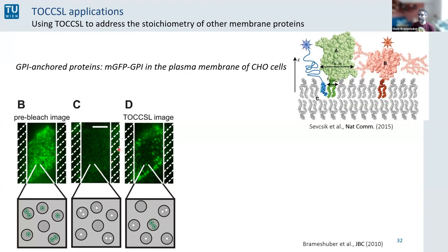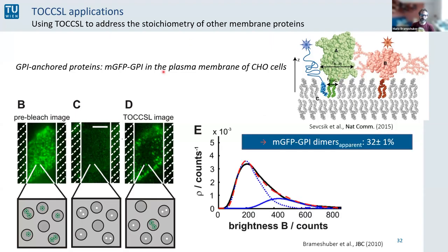What we basically detected using this technique was that GPI-GFP is not traveling alone in the plasma membrane. Indeed, with this approach, and that's why I mentioned this liquid nitrogen cooled camera before, single GFP molecules, as you know, are not really bright.